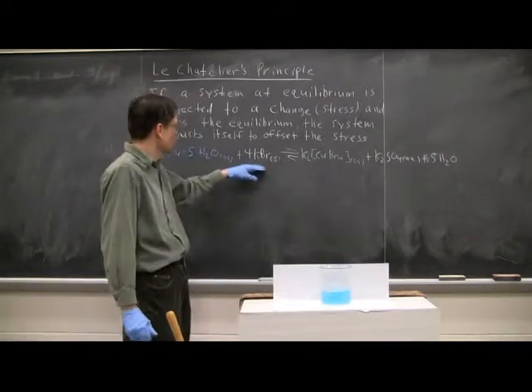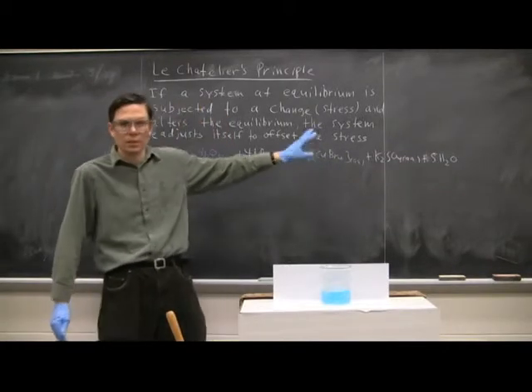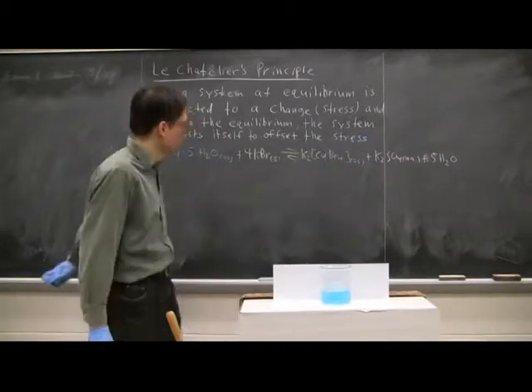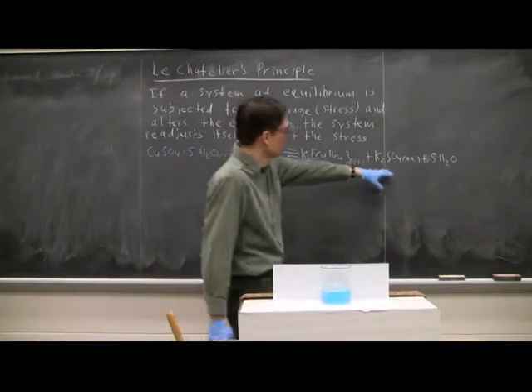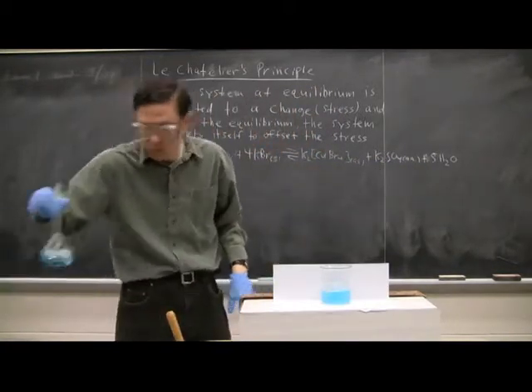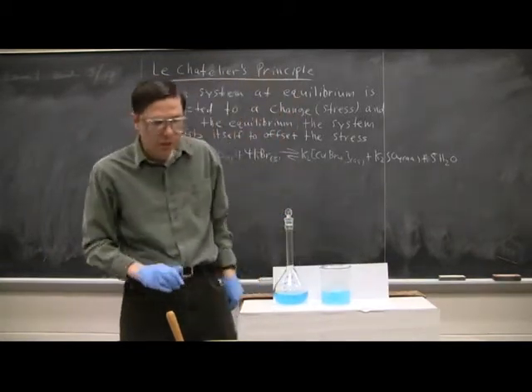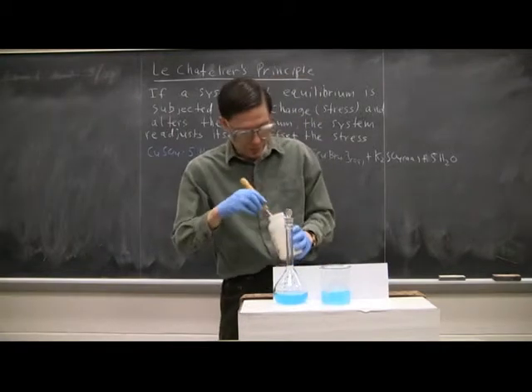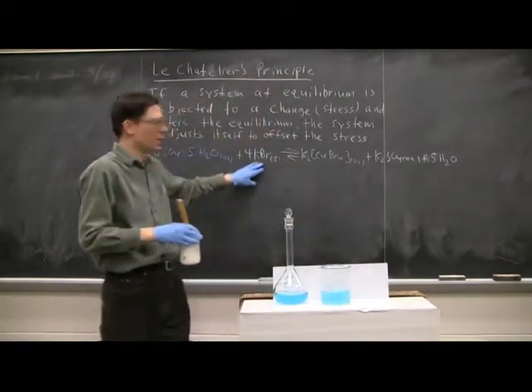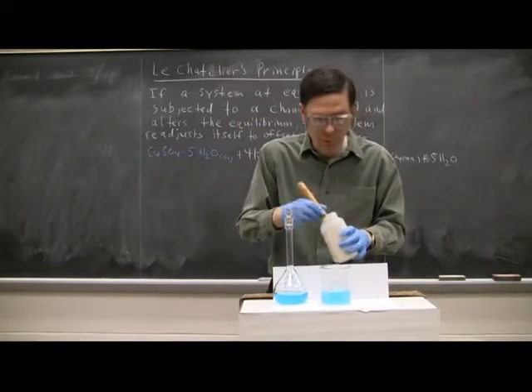And then we're going to add some KBr. And what we'll end up getting is a green complex, a potassium-copper complex, and then there's two other products: potassium sulfate and water. Now I'm going to leave this up here just as a comparison so you can see how it changes. So I'm going to add some potassium bromide here and I'll stir it and see how the equilibrium changes.